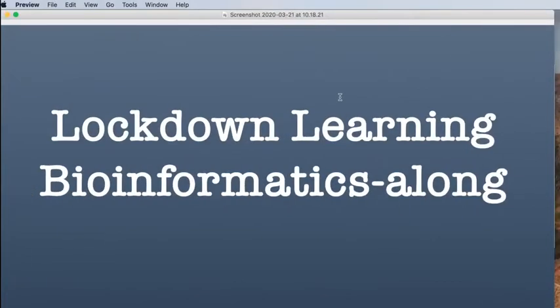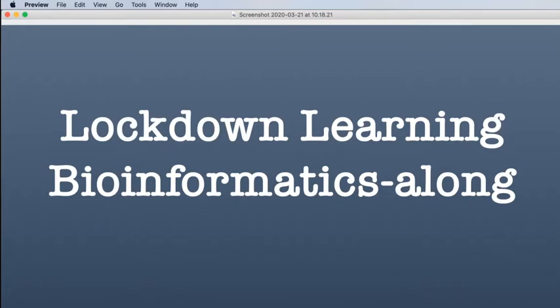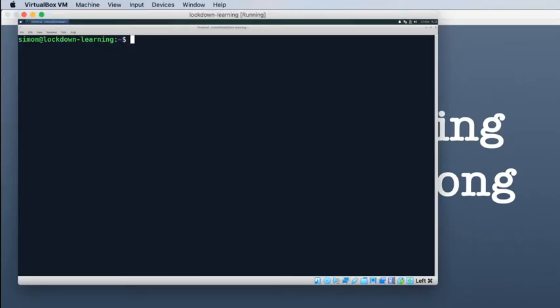So at this point, I'm going to jump back to my virtual machine here with my terminal, and I'm going to show you this structure in my virtual machine. The first thing I'm going to do is type the command pwd. Other than the things which I got you to type verbatim yesterday, this is the first command that you're typing in anger that I'm going to explain exactly what it does.